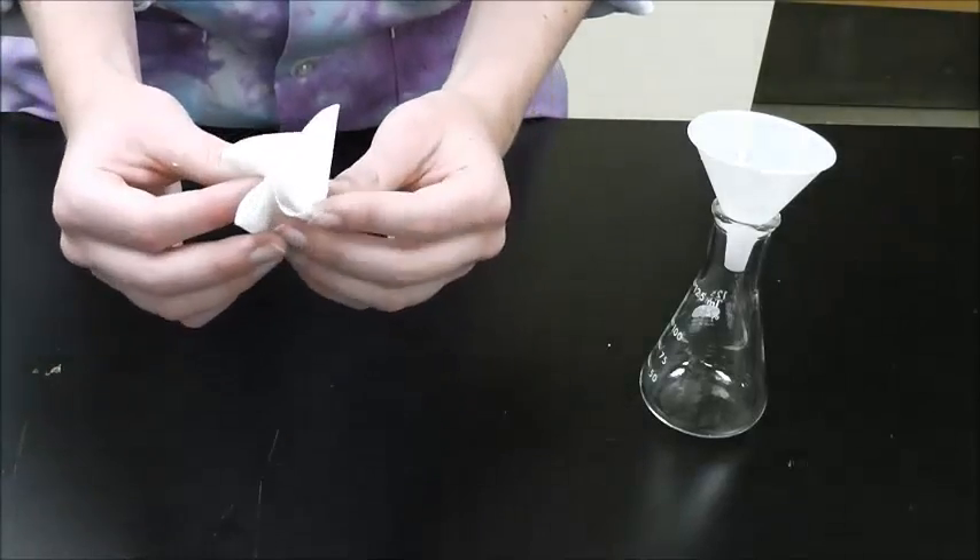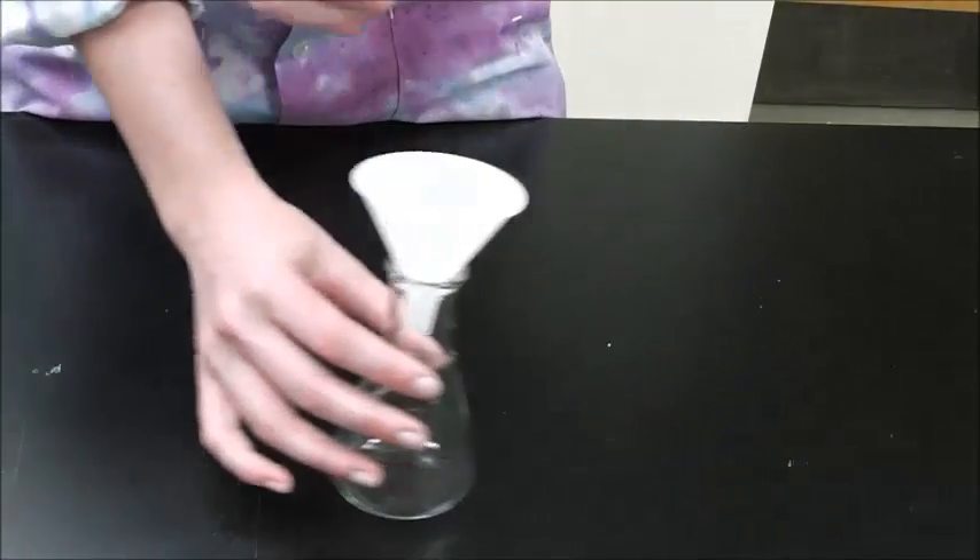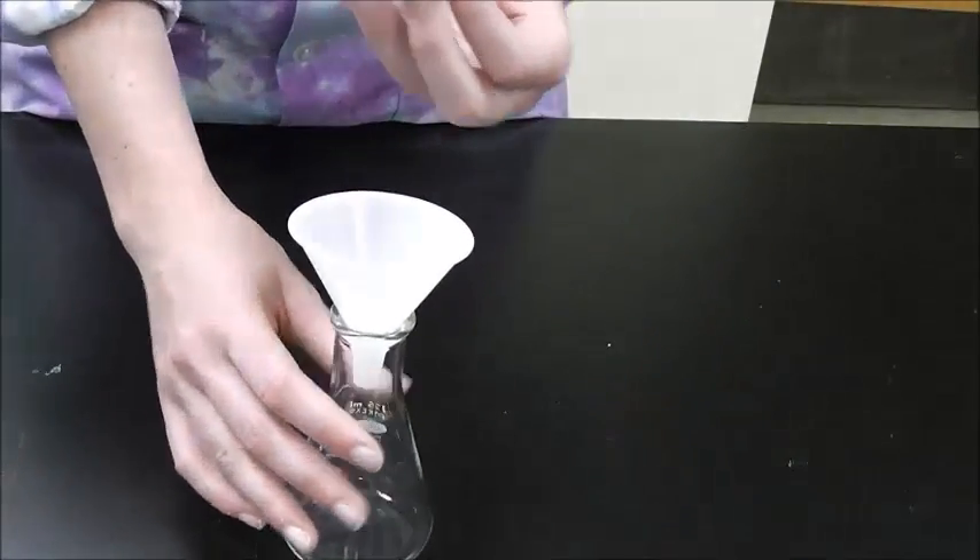To put your filter paper in the funnel, simply fold it in gently, and gently place it in the funnel.